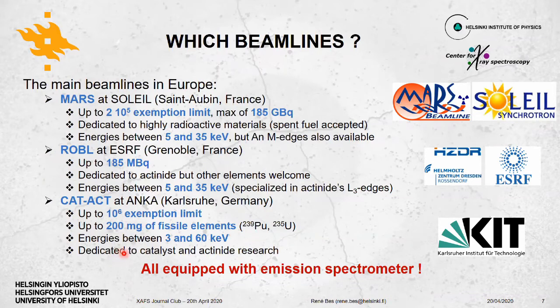And we are quite lucky because all of these beamlines are equipped with emission spectrometer. I will show later why it is so important for us.